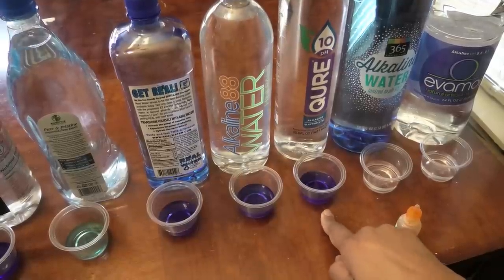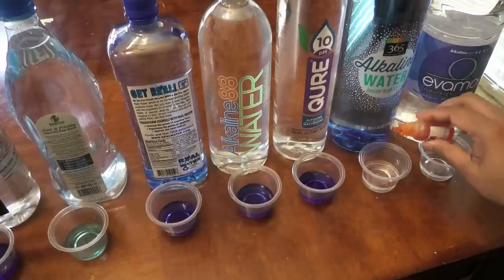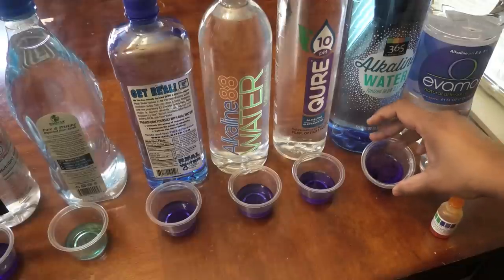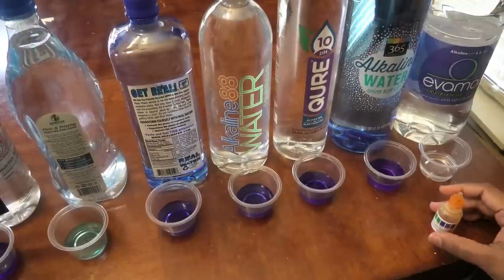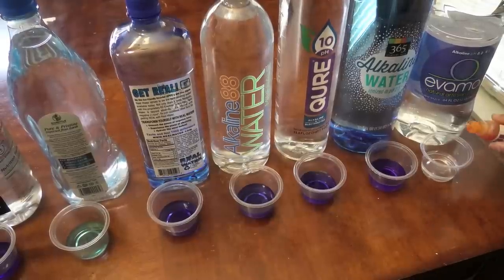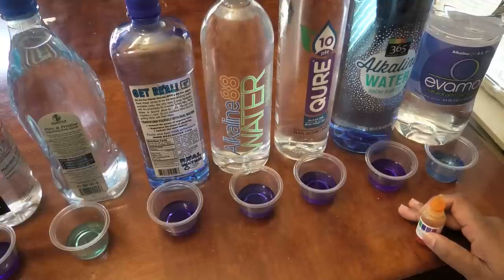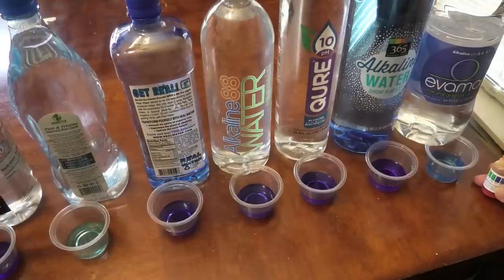Next is the Whole Foods brand 365 alkaline water advertising a pH of 9.5 — yep, it's alkaline, just like the Cure, in the same range, so very alkaline. Next is Evermore, which has an advertised pH of 8.8 to 9.1. This is alkaline, but not as alkaline as the 365 — I would say it's between a 7 and 8, maybe 7.5.